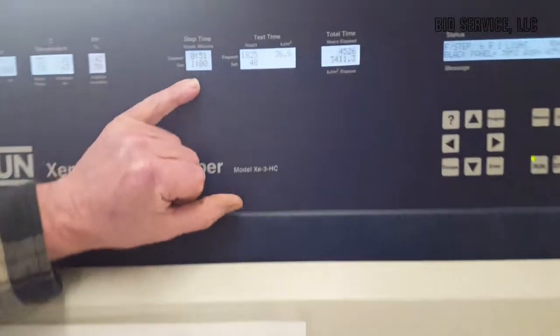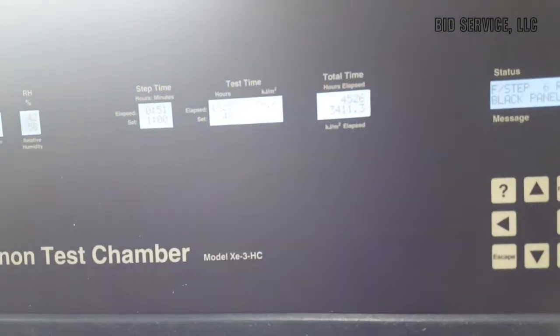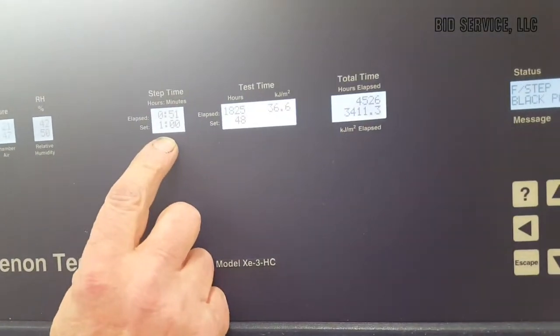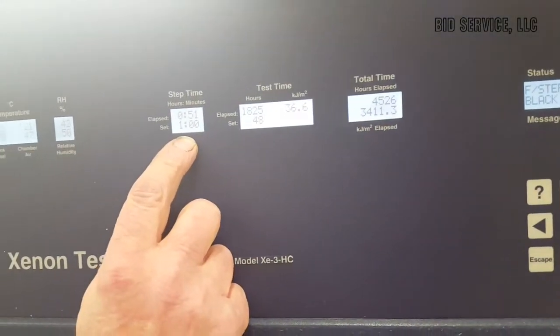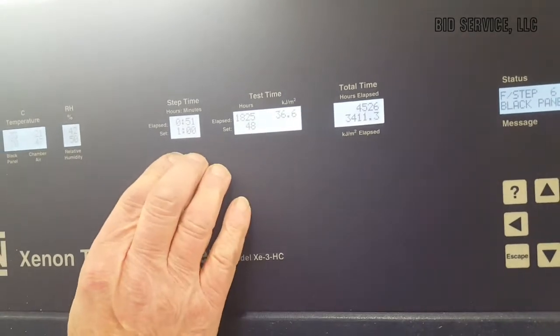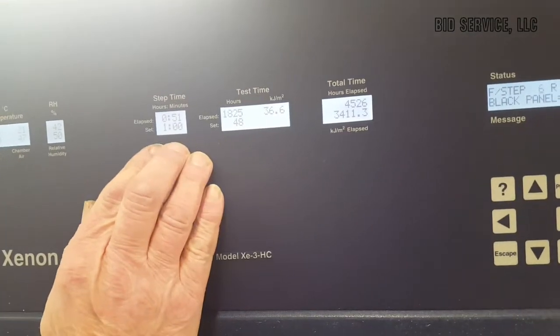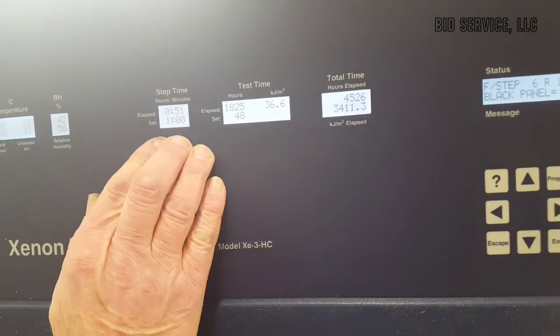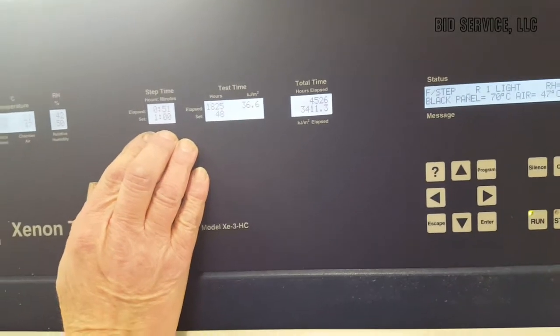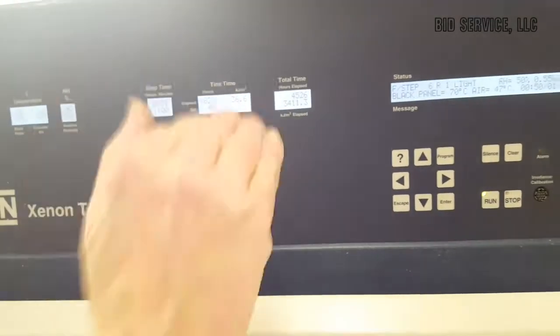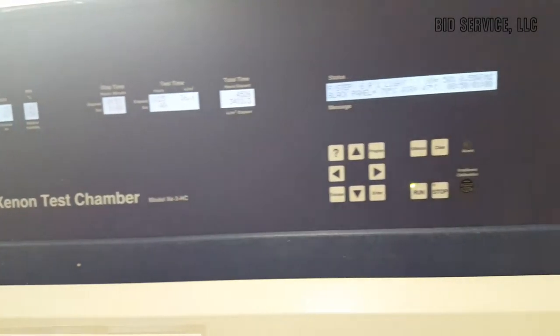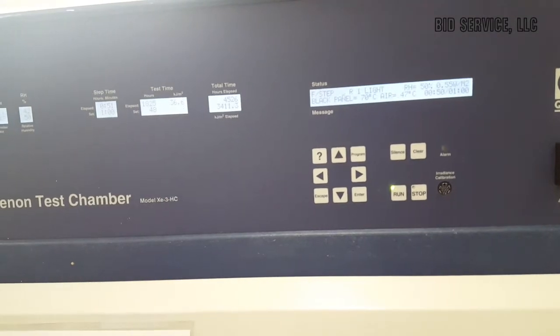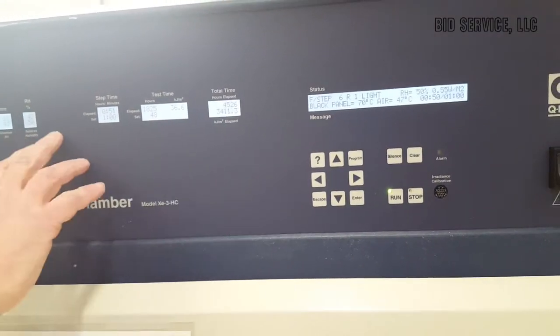Now, if we go to our timer here, this was a test that I ran yesterday, and I set it for one hour. So what I think we'll do is we're going to let this one run for a little bit and come back in an hour, and we'll flip to some other steps where it'll turn the lights on, turn the lights off, and you'll see the variance in the temperature.